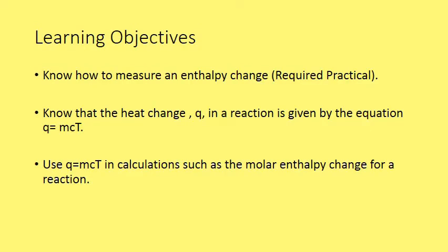And so lastly, let's check off our learning objectives and make sure we've set ourselves up okay. We wanted to know how to measure enthalpy changes, right? So we looked at a couple of pieces of kit to do the experiments with, and you'll be using that type of equipment in the lab for your required practical. So we've been through the first learning objective.